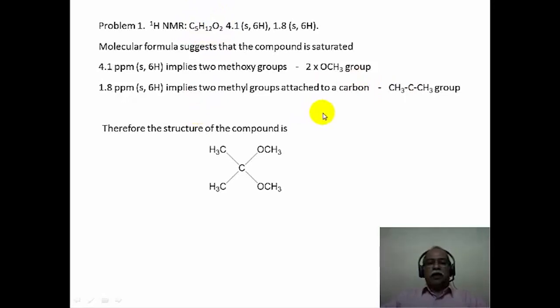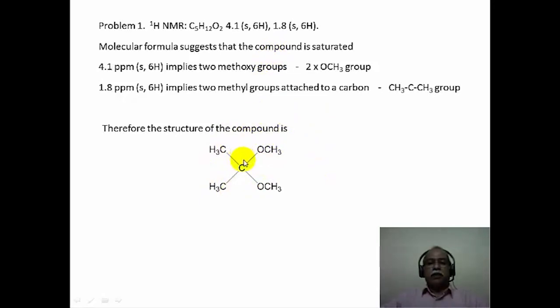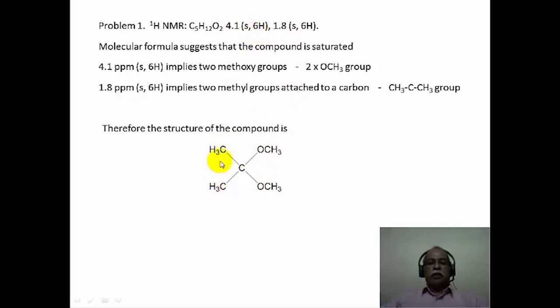The structure of this simple organic molecule is that it is a dimethyl acetal of acetone. Once you have the structure ready, you can confirm that there is no unsaturation in this particular molecule, and the 2 methoxy groups correspond to the 4.1 delta ppm singlet of 6 hydrogen, and the gem dimethyl groups correspond to the 1.8 ppm singlet of 6 hydrogen intensity.